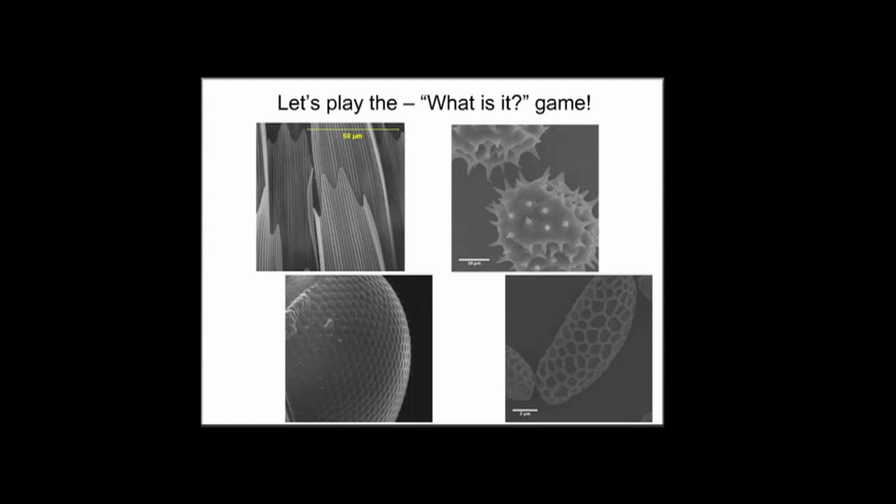So this is what usually happens. Students are just like, I don't know. They might not have any idea, and then I'll help probe them in and say, well, you might see a commercial about this. People suffer with it on a seasonal basis, and so those are the types of things that we talk about. So I'll go ahead and let you know it's actually a dahlia pollen. Not a lot of people know what dahlia is. It's a beautiful flower, and then I'll usually even post up a picture of that too so they can get an idea.